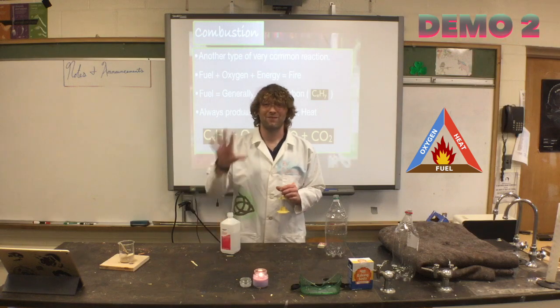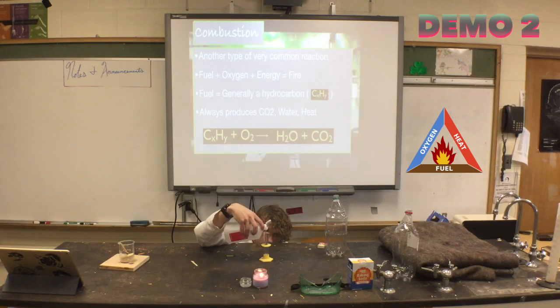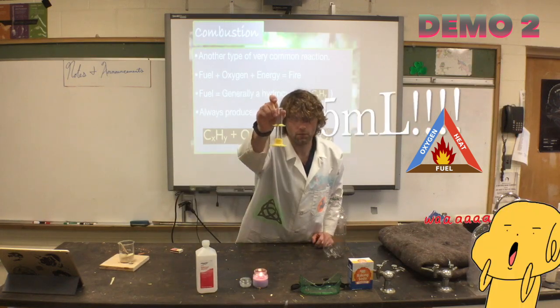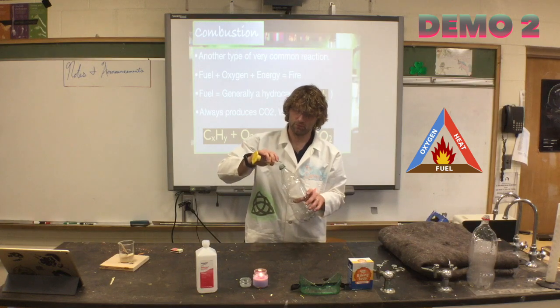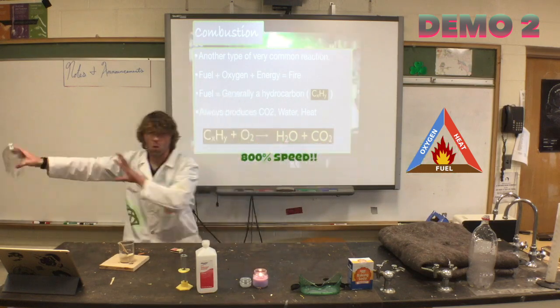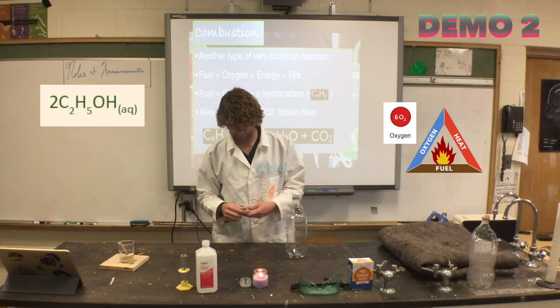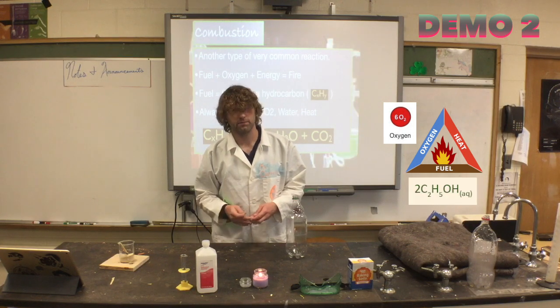This time I'm going to take 5 milliliters of ethanol. Okay. Fuel source out of the way. 5 milliliters of fuel. Okay, so we got our oxygen, our fuel source, and now we need to create a spark.